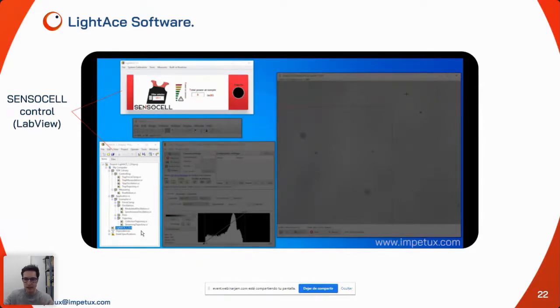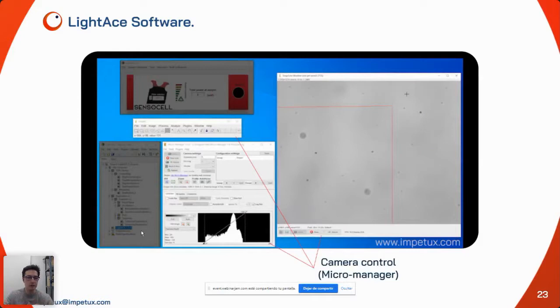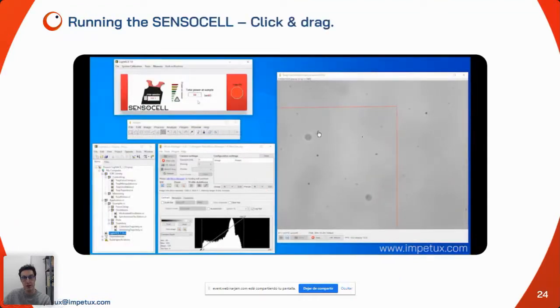Okay, and then we have Micromanager for imaging to control the camera or the microscope. Both softwares are integrated in such a way that you can operate directly in MicroManager, in this imaging window, to control the SENSOCELL features. So I'm going to show you how to generate an optical trap and how to move it in its most simple way. It's a manual manipulation, okay? We call it the click and drag mode.